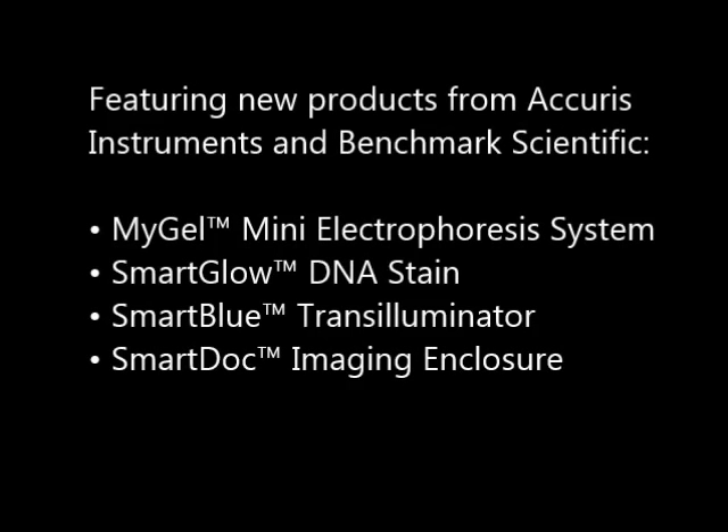During the demonstration, we'll be featuring some new products from Accuris Instruments and Benchmark Scientific, including the MyGel Mini Electrophoresis System, the SmartGlow DNA Stain, SmartBlue Transilluminator, and our SmartDoc Imaging Enclosure.